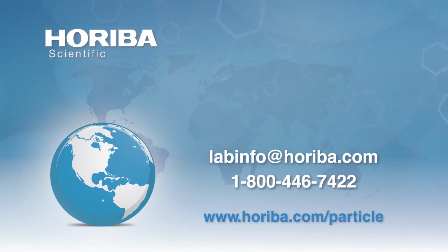So let me throw a few examples out here. In the lab, if you make measurements in distilled deionized water, forget about the pH, just in that water itself, that will bear no resemblance to a plant that uses plant water, hard water or soft water. So if you're going to do formulations and they're used in plants, get samples of water from the plant. That's one. Two is that, depending upon what you're doing, what dispersant you want to use, water is ubiquitous and is used in a huge number of suspensions.